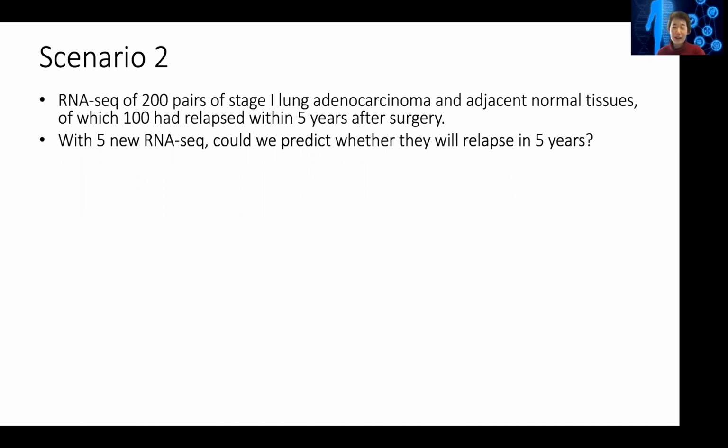So again, this is like 400 FASTQ files. So a lot of data to deal with. So what do we do first? Again, we will do read mapping. DESeq2. Frankly, when you have a lot of samples, sometimes you might want to just run Salmon and then do a clustering.